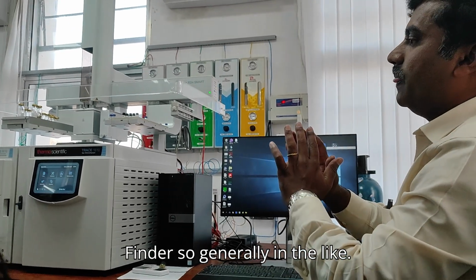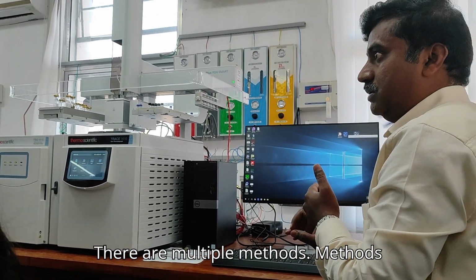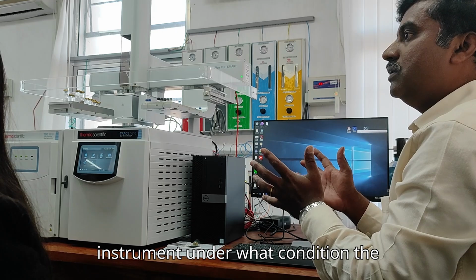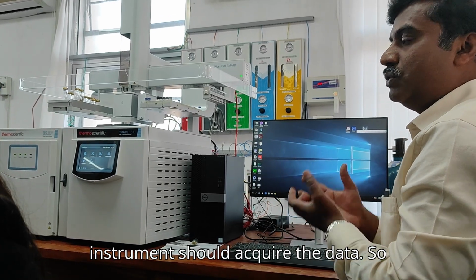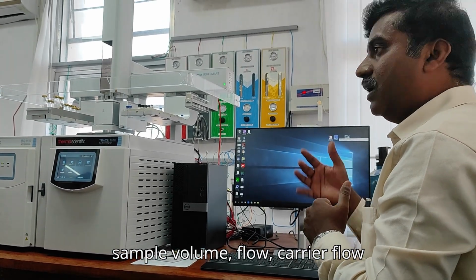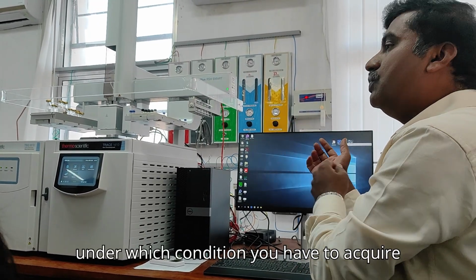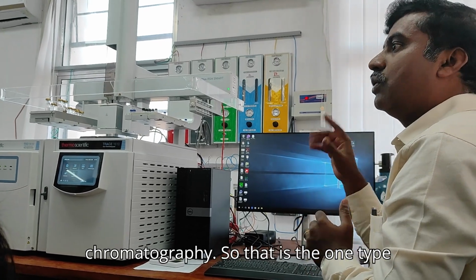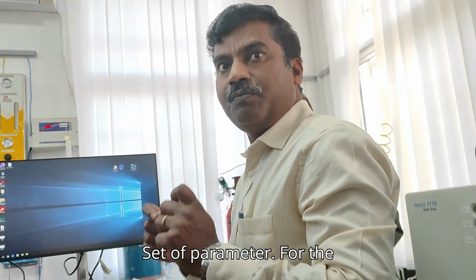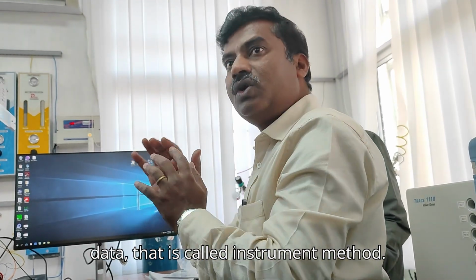So generally in the analytical flow, we need to create methods first. There are multiple methods. Methods means the set of instructions to the instrument, under what condition the instrument should acquire the data, right? Method to method we require certain parameters like temperature, sample volume, carrier flow, and pressure. These are all the parameters that need to be defined to the instrument, under which condition you have to acquire the data and produce the chromatogram. That is one type of method called the instrument method: a set of parameters for the hardware or instrument to acquire the data.